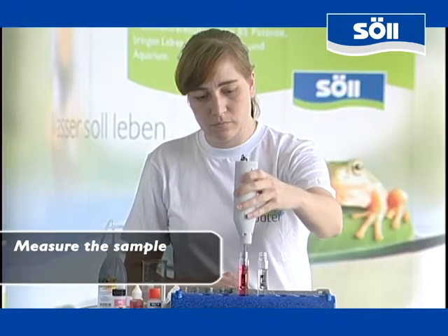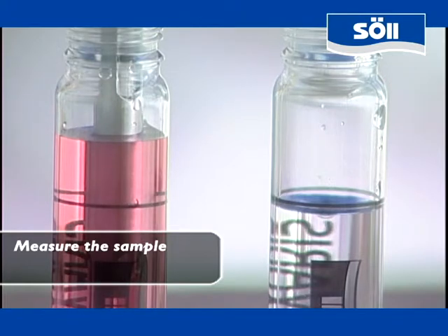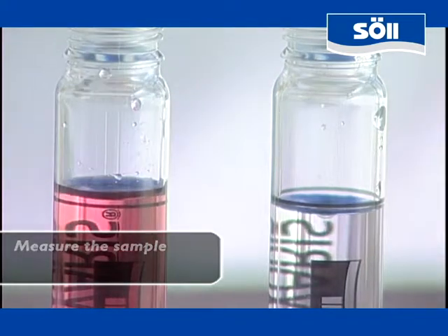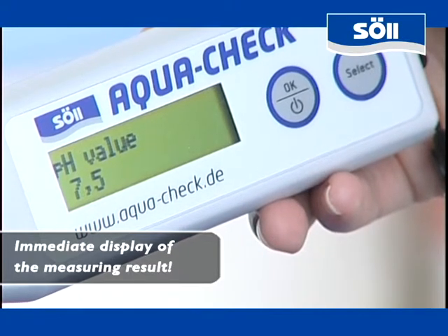In the second step, AquaCheck has to be inserted into the colored sample. Pressing the OK key activates the measuring process. Immediately afterwards, the photometer displays the measurement result digitally.